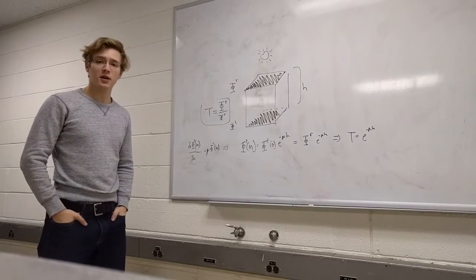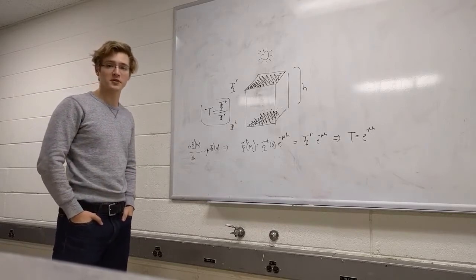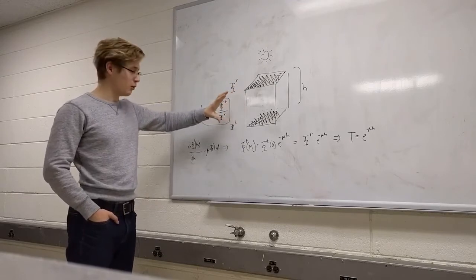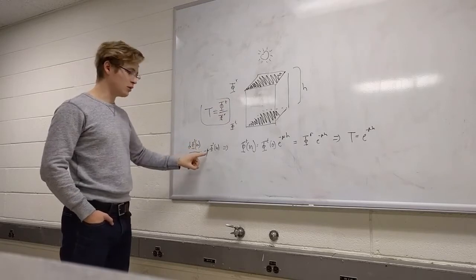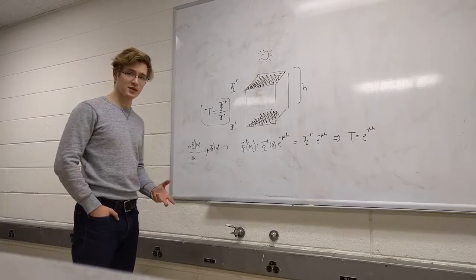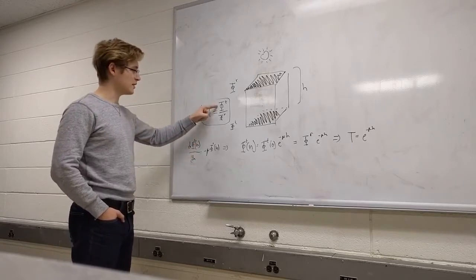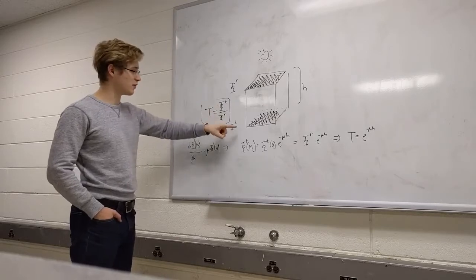Hey, so today I'll be talking about the Beer-Lambert law and how we're going to use it to study the optical properties of beer. The basic idea of the Beer-Lambert law is that you have some material with a linear attenuation coefficient given by mu that describes how light transmits through your medium. And the way we describe this mathematically is through the transmittance being the radiant flux transmitted through the medium.